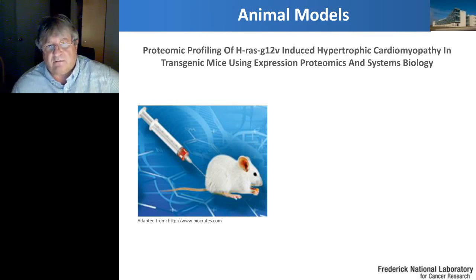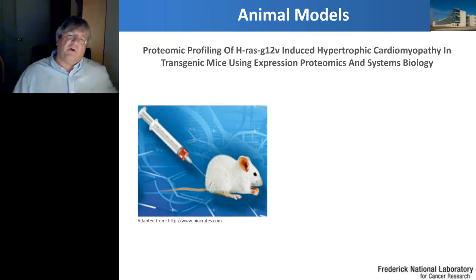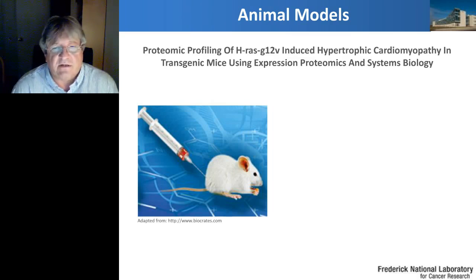So my presentation until now was focused on the cell surface of the cancer cell line for biomarker research or drugs, but mouse models are increasingly used in looking into biomarkers.